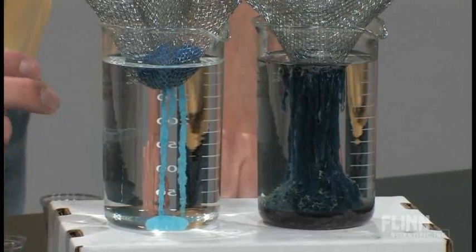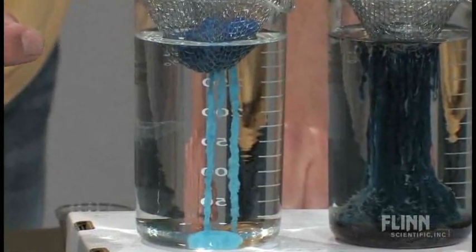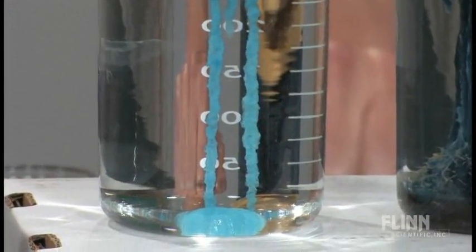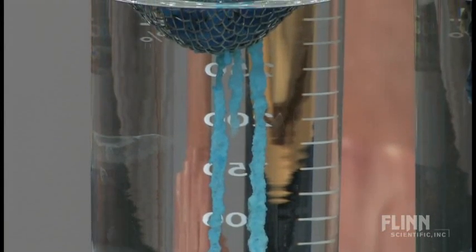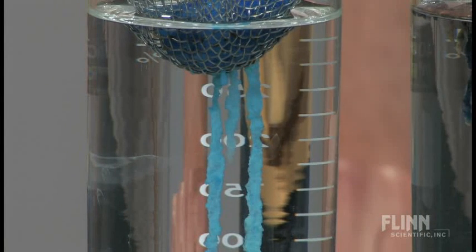The beautiful thing is, if you get a really close-up right at the end of one of the stalactites, you can start to see the actual crystal growth. If you sit there and watch very still, you can actually start to watch the crystals forming as they drip down. It really is a spectacular thing if you can get your students to just sit there and watch, because we so rarely get a chance for students to observe crystal growth.